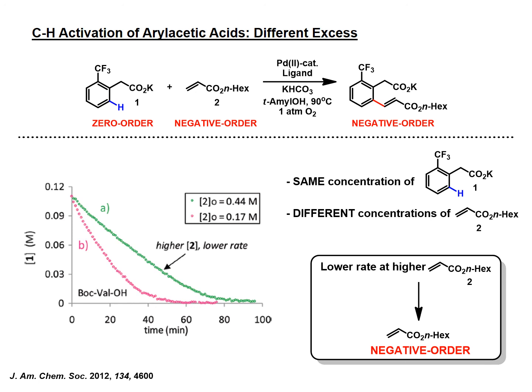That's not really a typical kinetic scenario. You have no positive driving forces in the stoichiometric components of your reaction. One thing doesn't do anything. Two things hurt you.